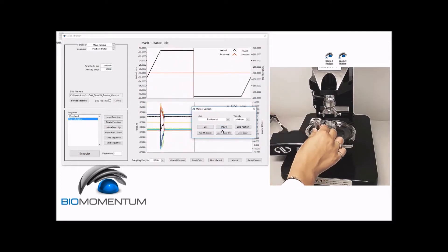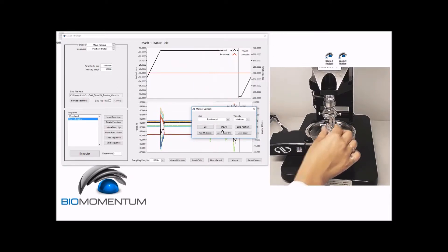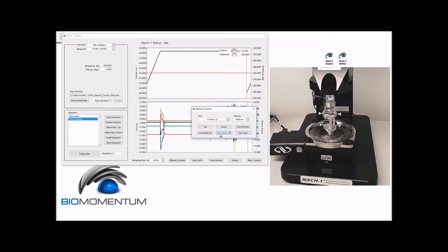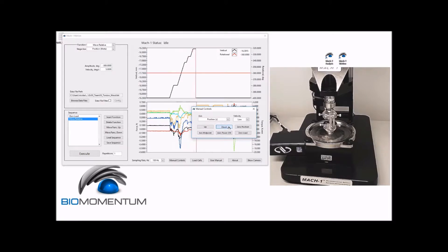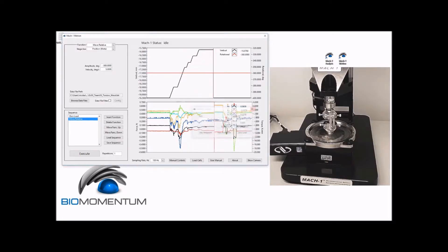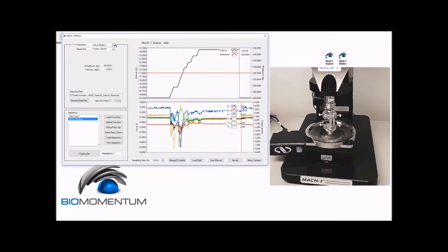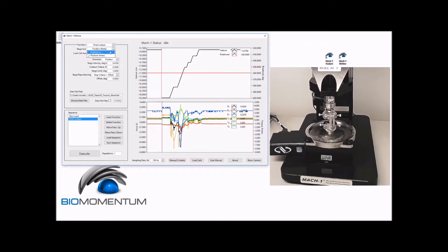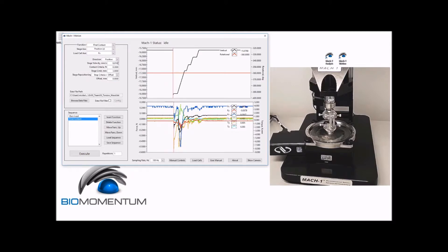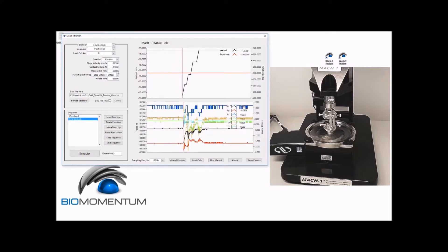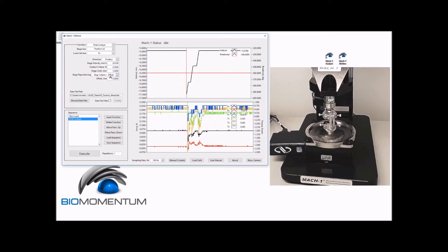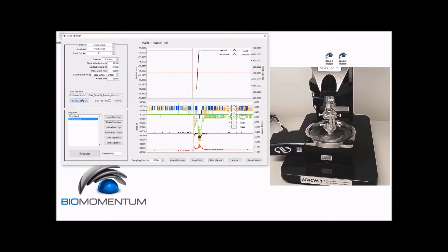Then insert the mounted sample into the torsion bases. Using the manual controls, lower the stage at low speed to approximately two millimeters above the upper torsion adapter. Now perform the following sequence: a zero load followed by a find contact with the stage axis as the vertical position and a velocity of 0.01 millimeter per second, a contact criteria of 0.3 Newton, a stage limit of three millimeters, and a stage repositioning based on the stop criteria plus an offset with the offset being zero millimeter.